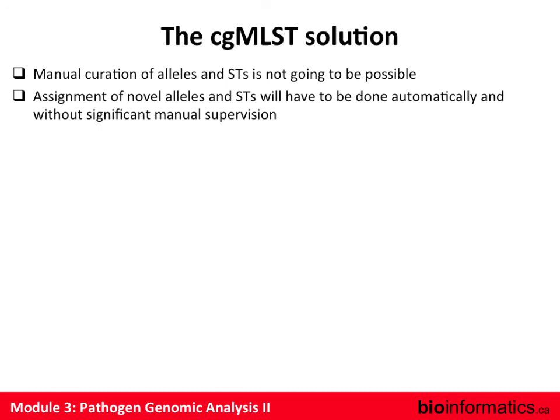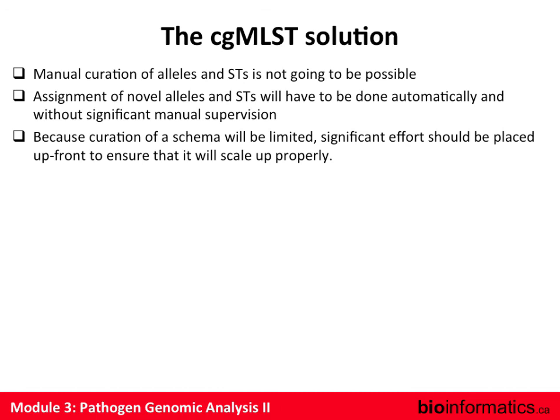And the reason why this becomes a really powerful thing is because we need to be able to develop a scheme that takes care of itself, that doesn't require a lot of manual curation, and that will scale up with thousands of genomes, that it will behave, right? So if you keep genes around that are not core, you're begging for a butt kicking. No one's going to have a job of curating every gene in your scheme. No one's going to do that. A computer's going to do that, or a program's going to do that. So the more difficult it is, the more biologically noisy it is, the worse it's going to be to curate.